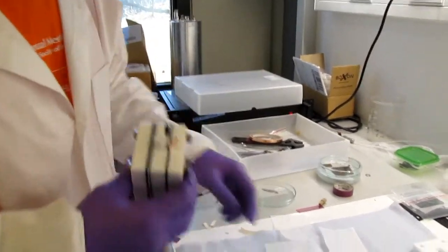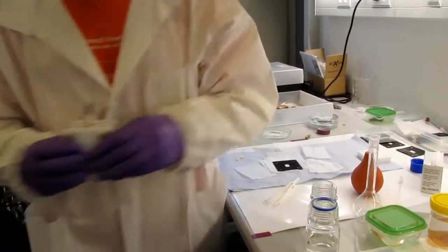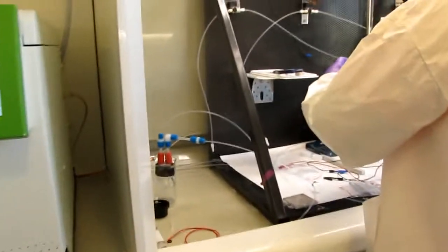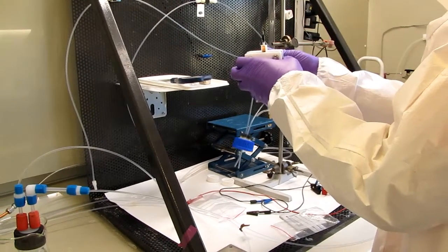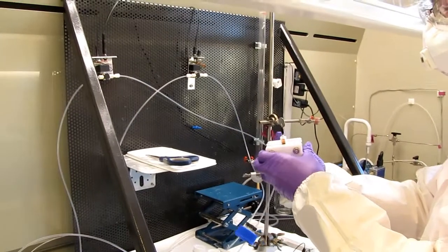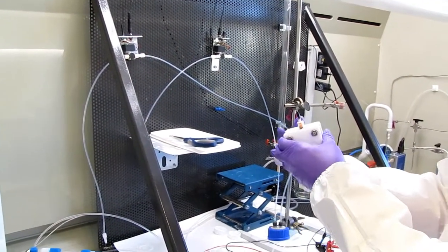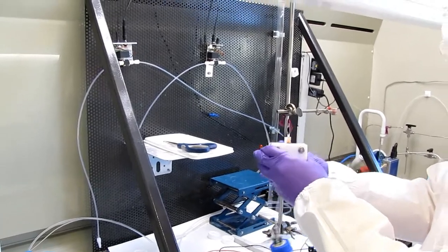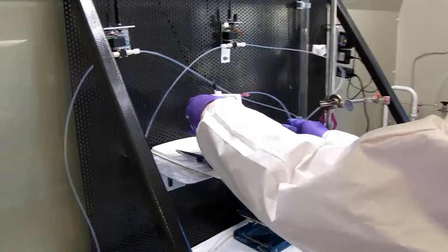Okay, I'm going to assemble it and connect it with the real stuff. But the one that Gaston has is an MEA, which is different. He doesn't have the catholyte. It's humidified CO2 directly. In that case, I don't know why he cannot go to very high current density.